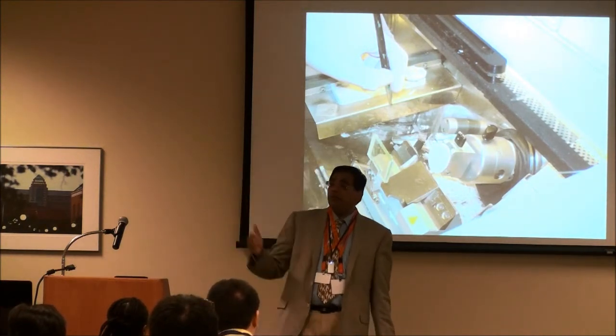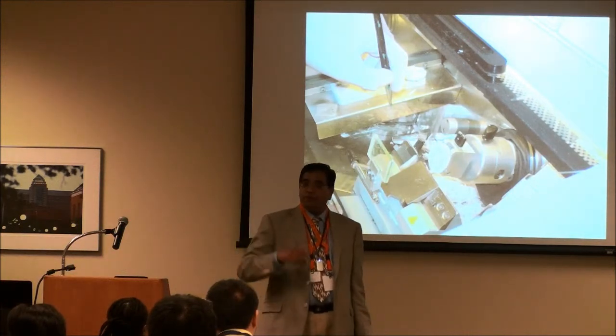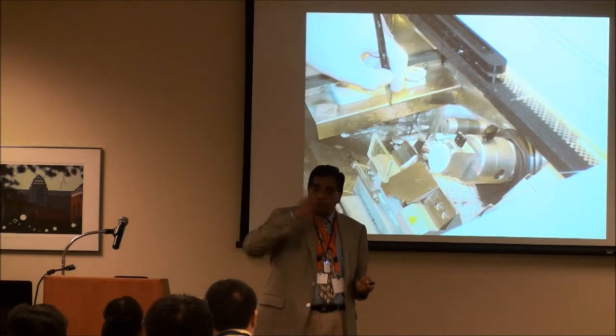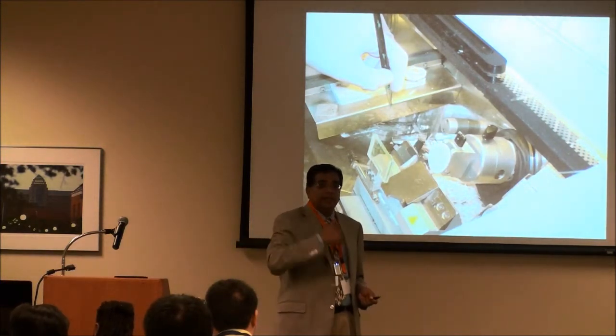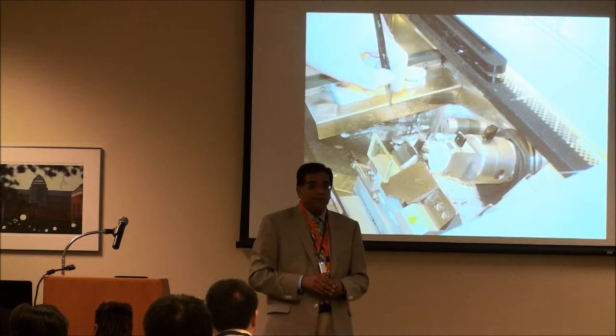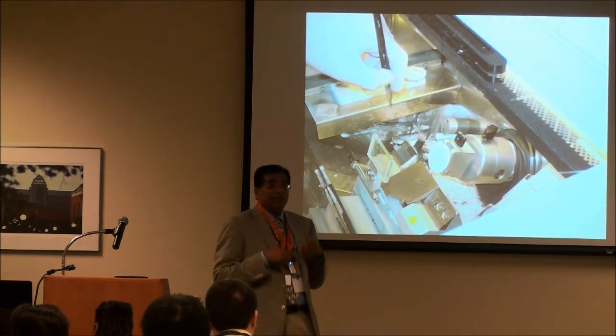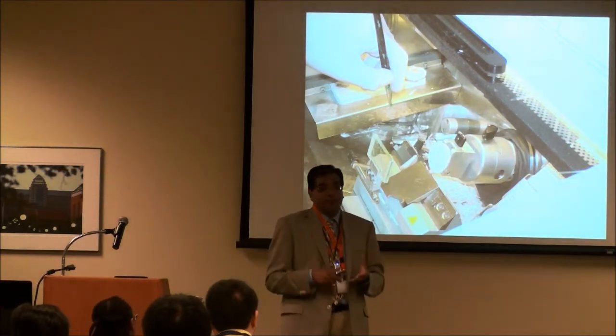Why do we wait for 24 hours? If this was such a wonderful technique, we would take all the fresh tissues, cut them up, do a frozen section, give the diagnosis 20 minutes later, and everybody's happy, right? What we get here is something called freeze artifact, which makes the histology a lot more difficult.